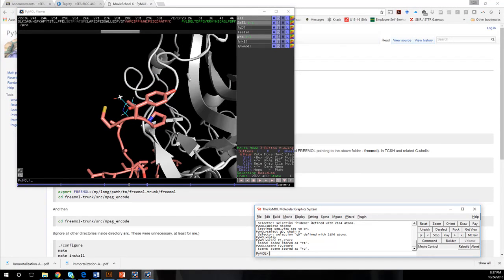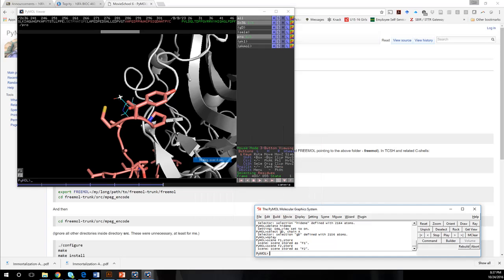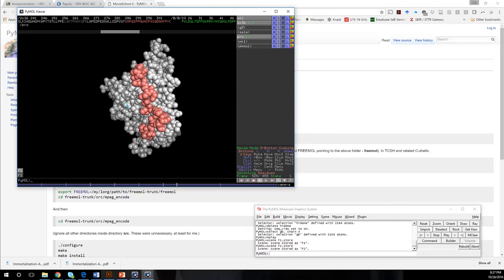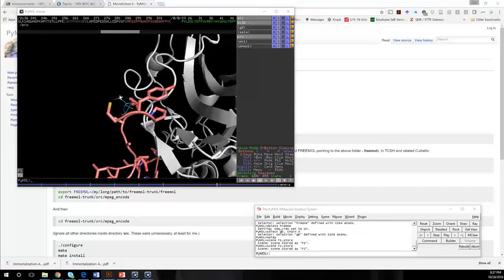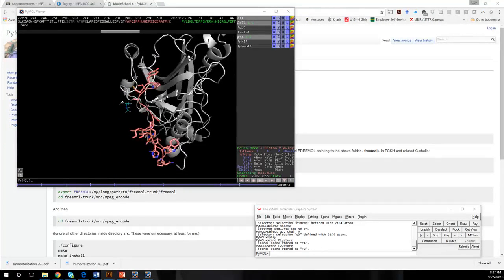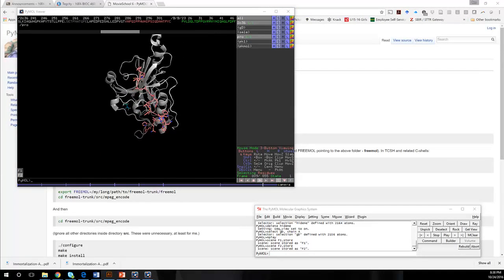Then I'm going to go to movie, program, scene, Y-Rock. If I hit play, I can see that I'm going to zoom into that location. Then I'm going to zoom back out, and I'm going to keep rotating through.